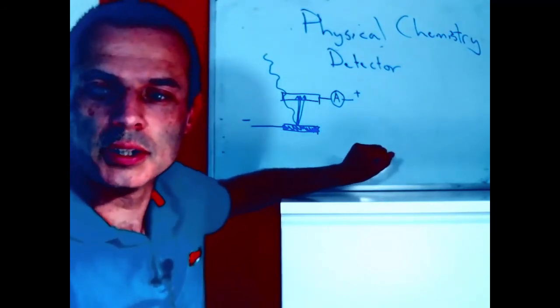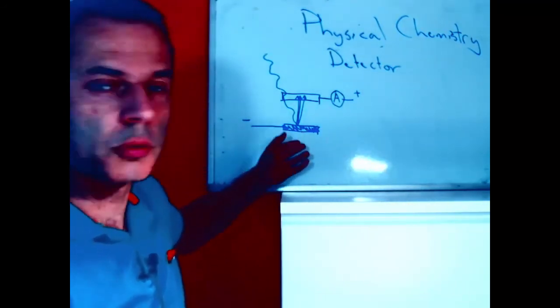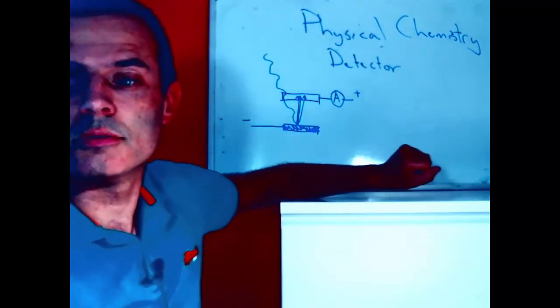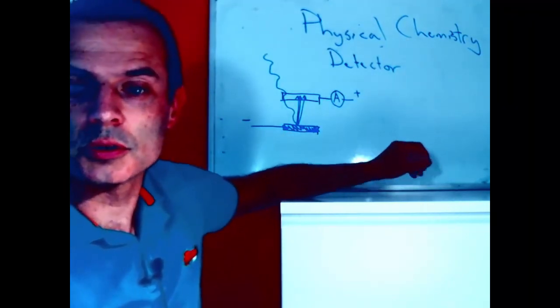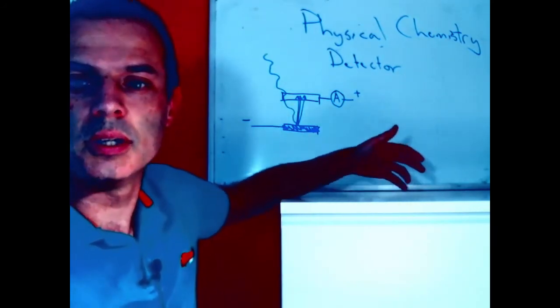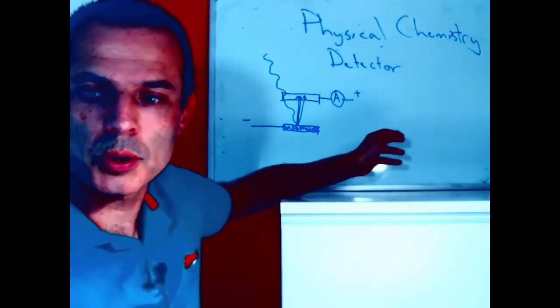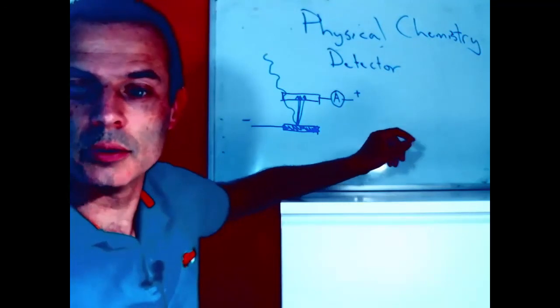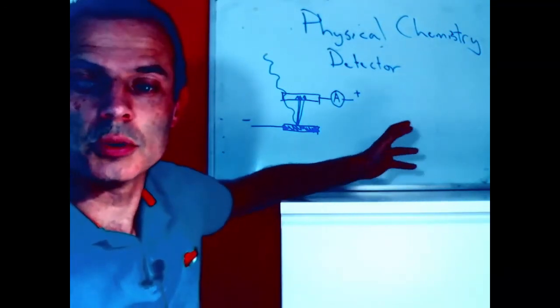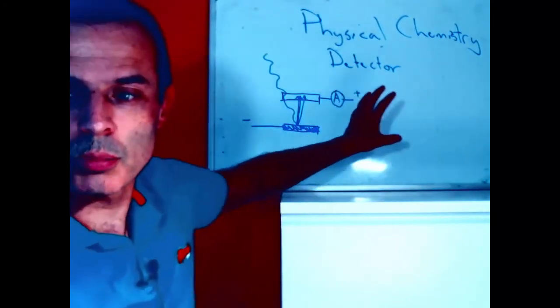However, they're very useful techniques and much more used in material science, because if we want to measure a metal, infrared is fairly useless. This is much better for infrared because it doesn't get affected by the conduction of the material. It's much better in composite materials because we have better penetration and we're looking at all of the elements in there. Graphite, for example, is difficult to measure with infrared. It does have a Raman signal. So these techniques have their place.